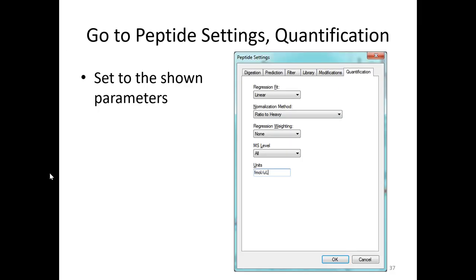Okay. So we're going to build. You're getting that because you click on the proteins, which you will find peptides, and go to the peptides, and you'll see what it is. There you go. And then for this one, this is peptide, so right click in there.